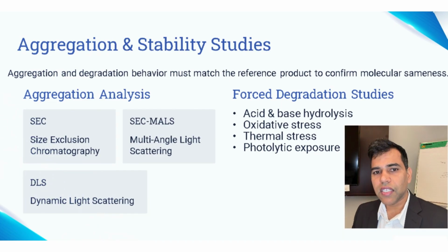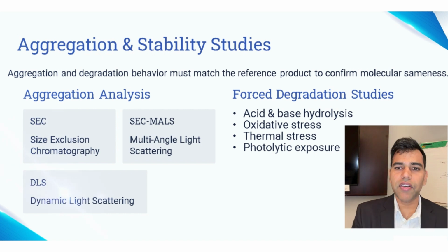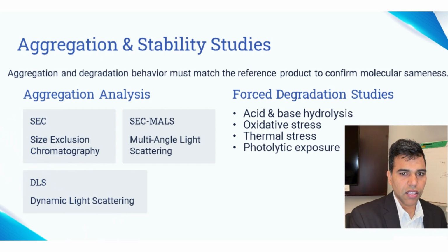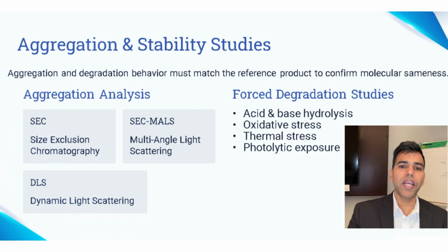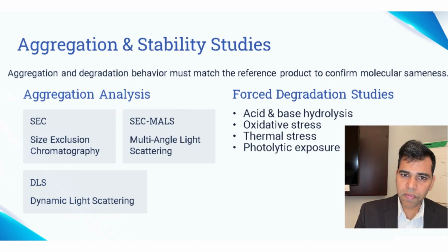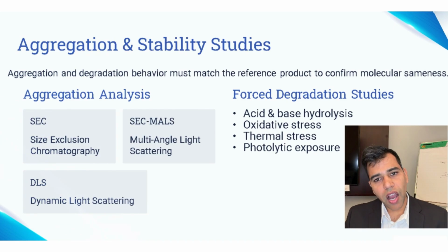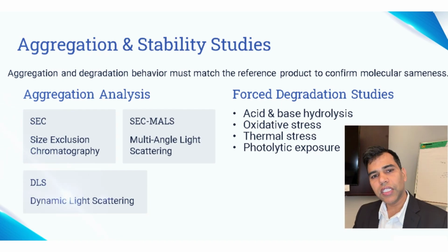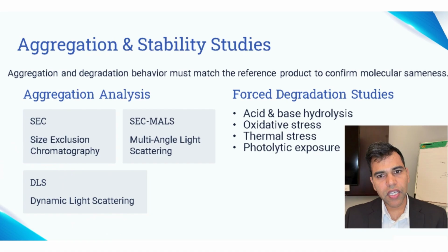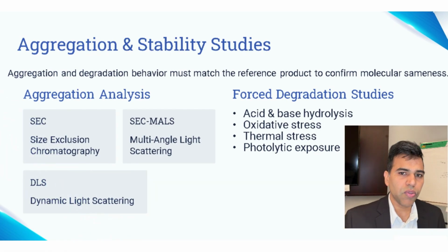Forced degradation studies, acid and base hydrolysis, oxidative stress, thermal stress, and photolytic exposures, are designed to break the molecule intentionally and then compare how it breaks relative to the reference. Do you see the same degradation products in similar proportions through similar pathways?